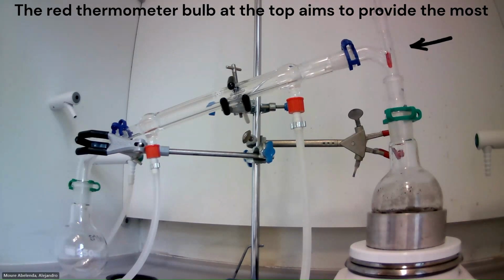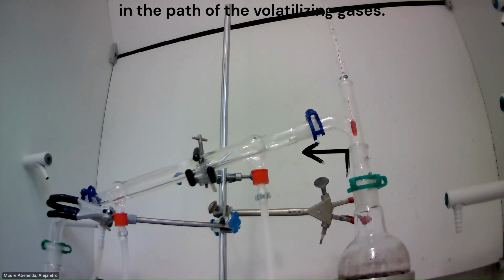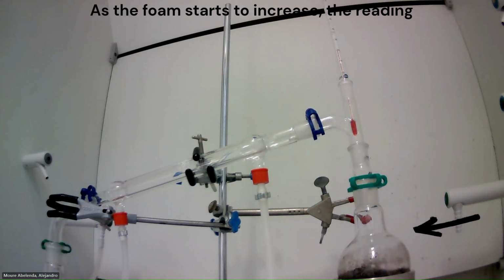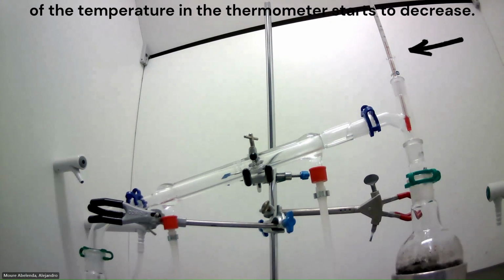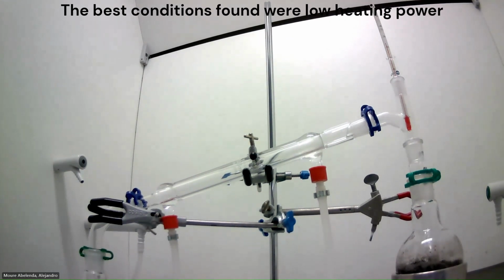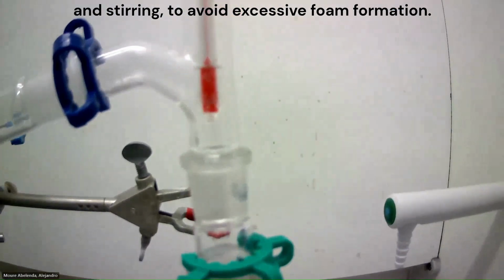The red thermometer bulb at the top aims to provide the most accurate measurement of the boiling temperature, and this is located in the path of the volatilizing gases. As the foam starts to increase, the reading of the temperature in the thermometer starts to decrease. The best conditions found were low heating power and stirring to avoid excessive foam formation.